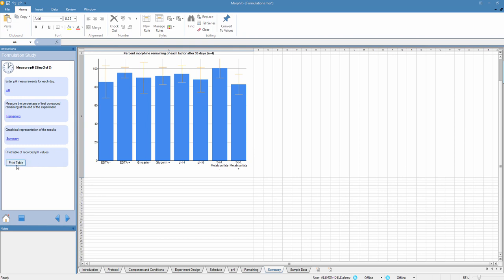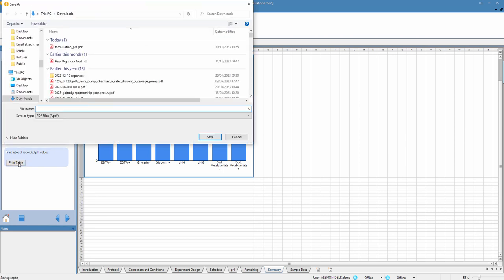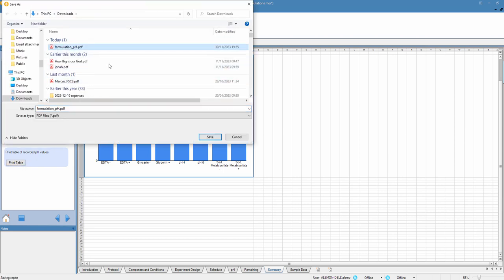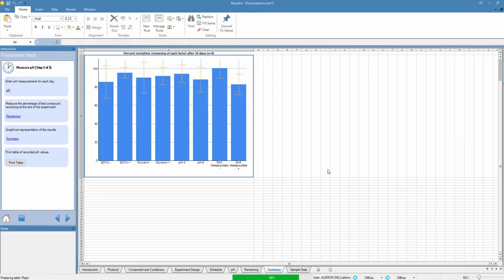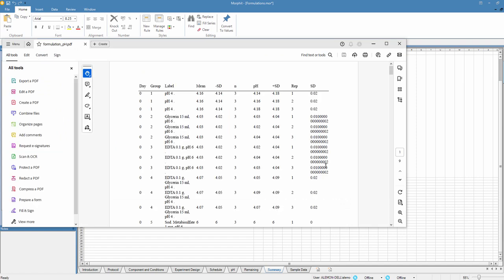Finally, I'm going to generate a report containing the raw data, which in this case is going to be the measured pHs in a table. I'll press the print button. We'll save it over an existing document. We could have chosen a new one.